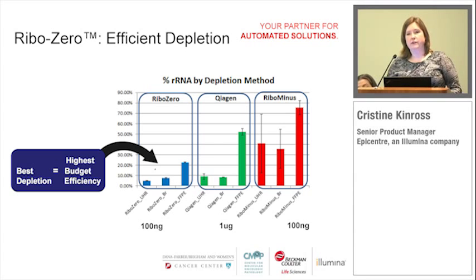And why this matters is that as sequencing throughput increases, Illumina's had some very big announcements in the past 2 weeks about greater throughput and reduced cost of sequencing. We still want to drive that cost of sequencing further down. So if half of your reads, when you're done with sequencing, are going to be something that's not biologically informative... Now, ribosomal RNA is important. I'm not saying that we don't need it to function, but it's unlikely to offer the cure for cancer. There's no indication right now that that is actually going to develop the next therapeutic. And so we want to remove that up front before we pay to sequence it. And that's the entire purpose of this part of the kit.